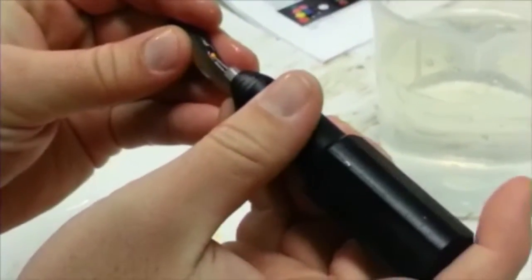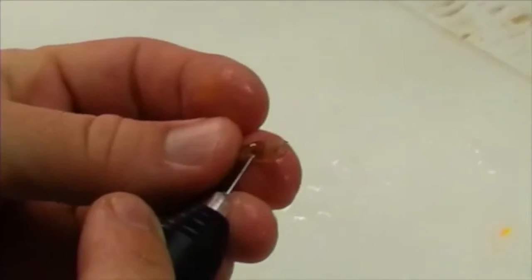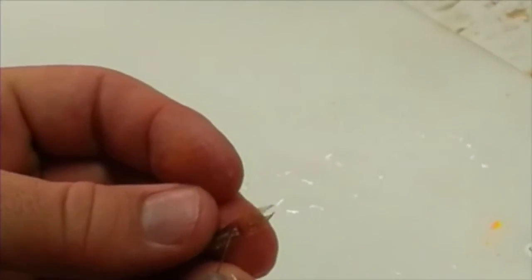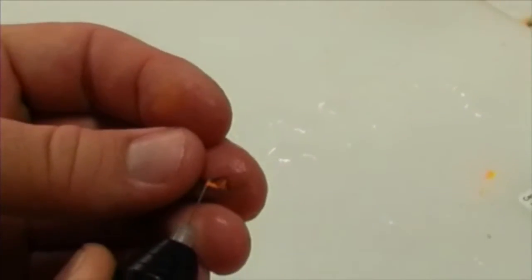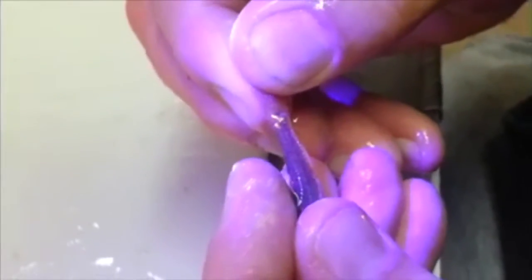VIE should be applied to easily detectable areas like the dorsal and caudal fins. Ultraviolet light illuminates the elastomer for easy identification.